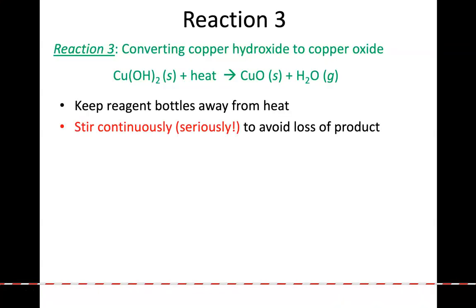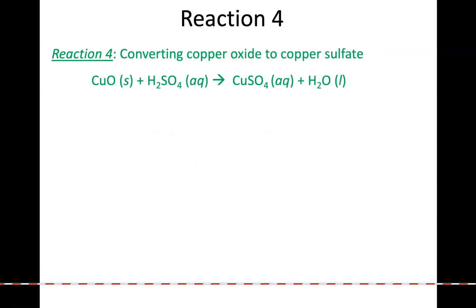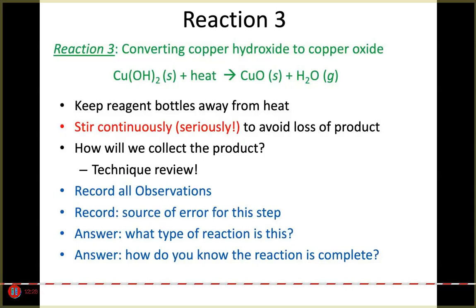Again, some of these things are left in here because it's from when we were running it. Oops, we go back one. Right, during a real lab. And actually, this is probably not the most dangerous lab, but out of all the labs we do, it's the one that could actually harm you the most. So this is why there's so much safety you see popping up. But again, recording observations, if you were doing this experiment, there's a source of error at every step.